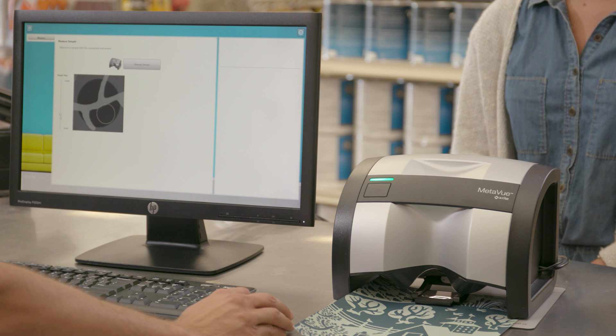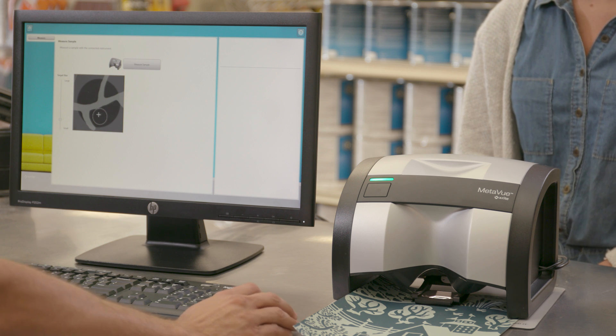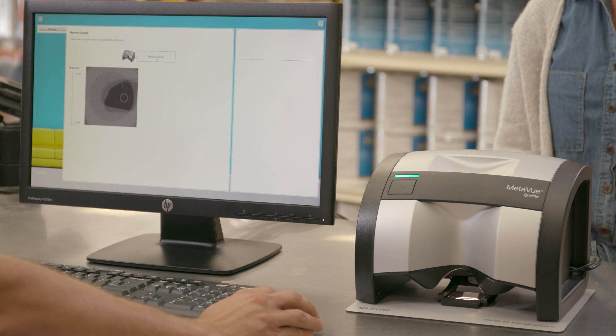On-screen targeting provides you with a live view of your sample to help you select the best position zone for measurement. Variable aperture sizes from 2 to 12 millimeters allow you to pinpoint your colors with unprecedented accuracy.